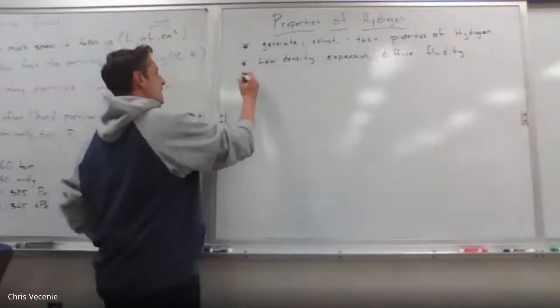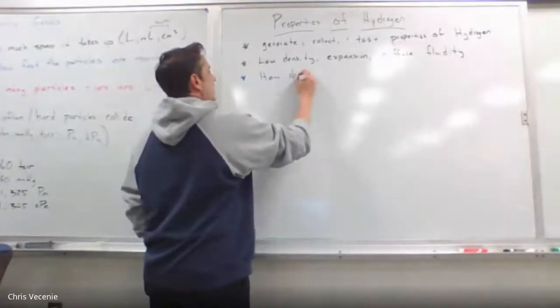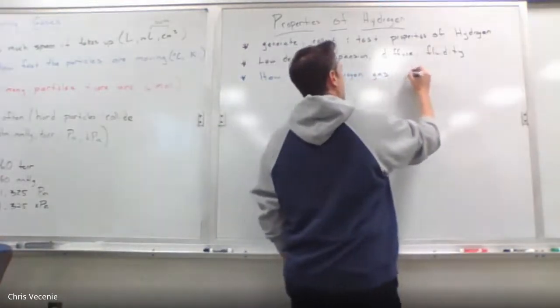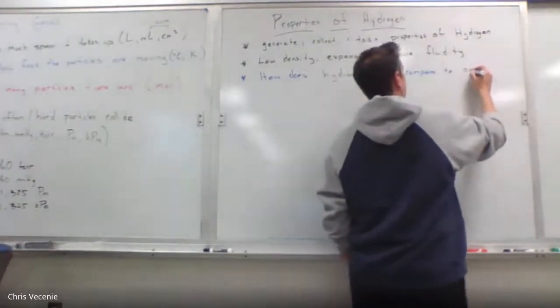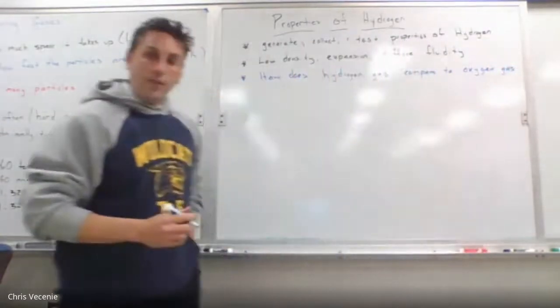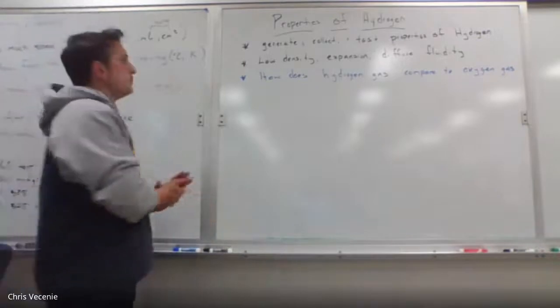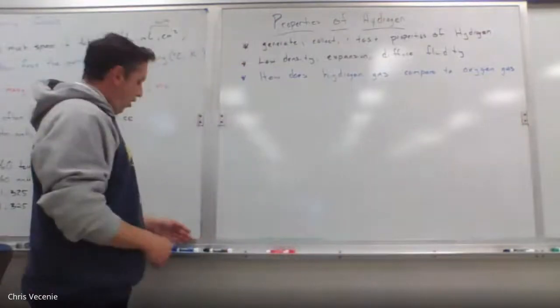And then last but not least, we want to see how does hydrogen gas compare to oxygen gas? Are they the same? Are they different? Let's find out. All right, so first thing we have to do is create our hydrogen gas.